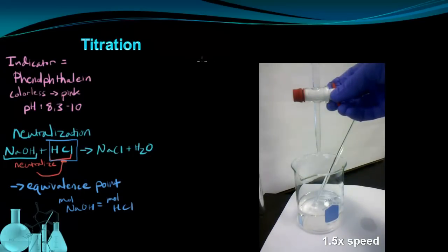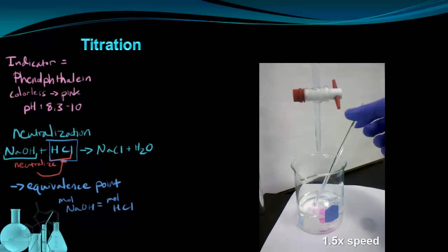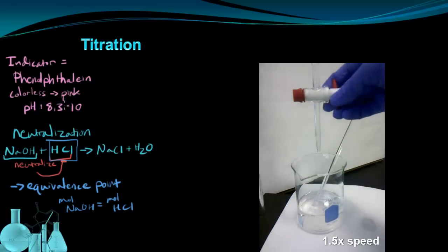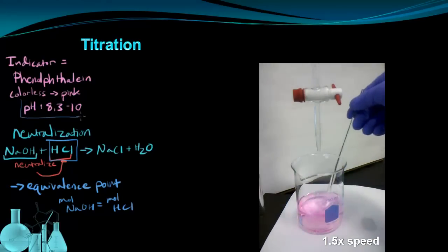So for the titration itself, as I'm going through and I'm constantly adding base, I'm looking for a slight permanent color change because that's going to tell me that I've hit this pH range, 8.3 to 10. And the phenolphthalein changed color.